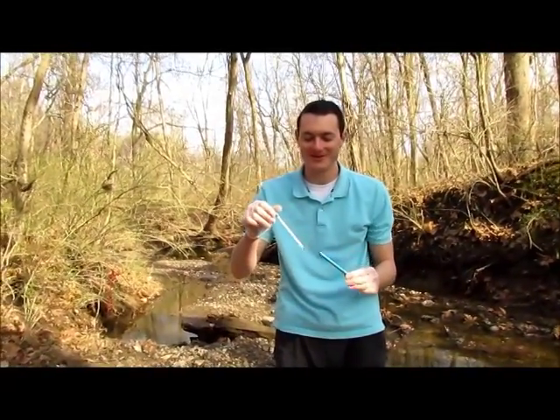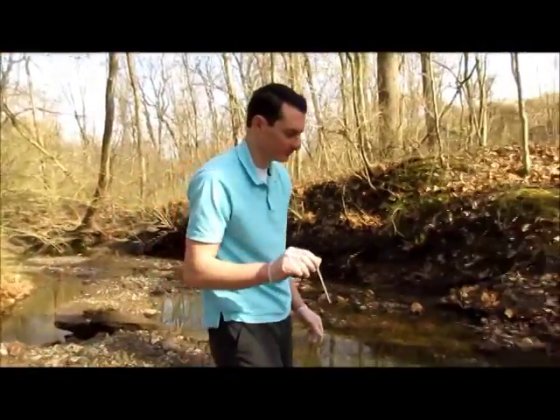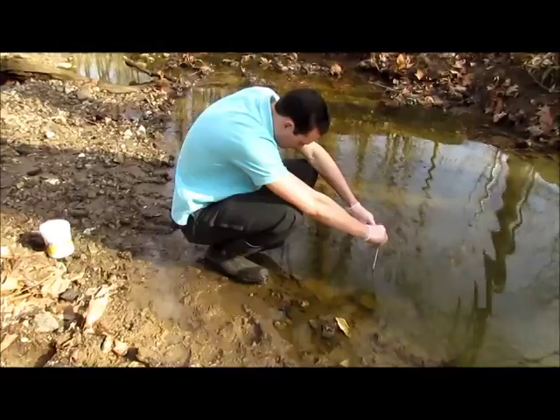In this video you will learn how to do the temperature test for the stream discovery program. While we use a LaMott low-cost water monitoring kit to do most of our chemical survey, we do use a plain alcohol thermometer for our temperature test.